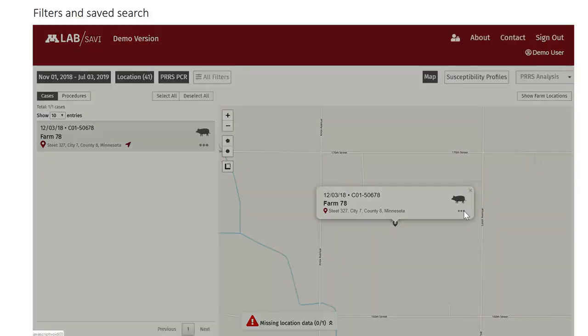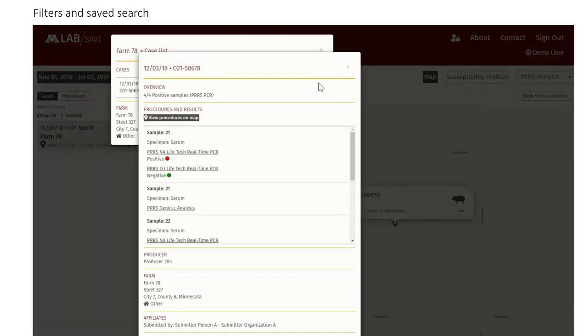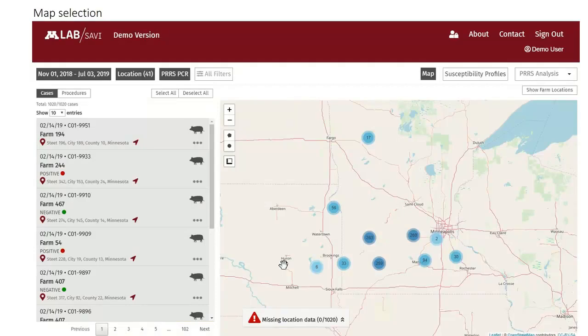case that came in. The little information buttons that show up on all these different things allow you to dig back further into the case, and so you can get more of the detailed information if you want on that case, or click out of it if you don't. So that's a pretty quick little skate through how you can set up your filters in order to access specific data that you're looking for. Okay? So filters and save search.